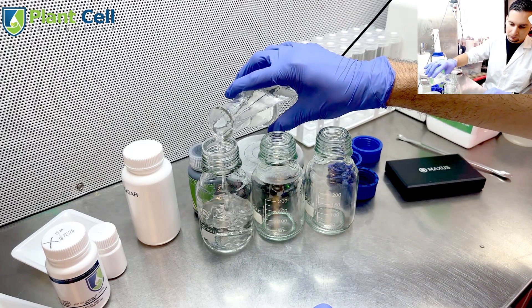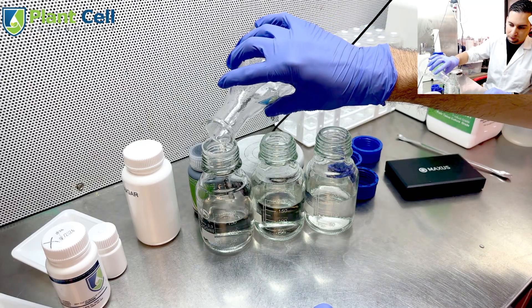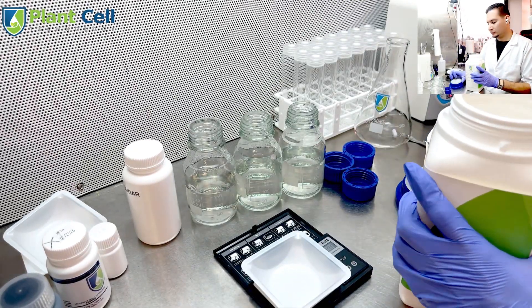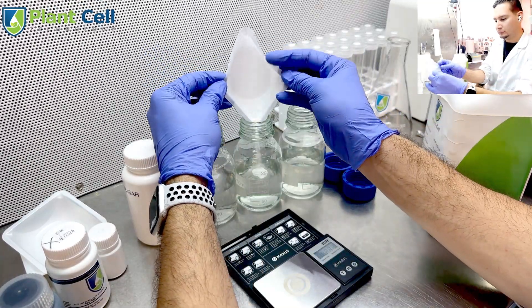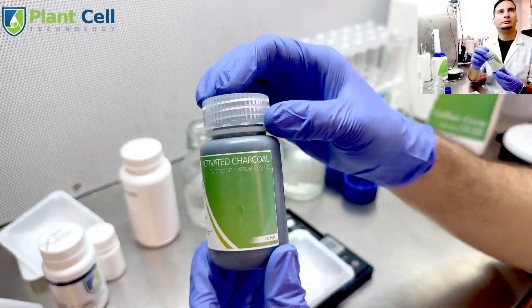Then we have to calibrate our pH to 5.8. After that, transfer the media into some jars — I'm using three different jars because I want to make three different colors. The next thing is to add our solidifying agent; I'm using Gellan Gum, which is going to make a very transparent gel, which is great.